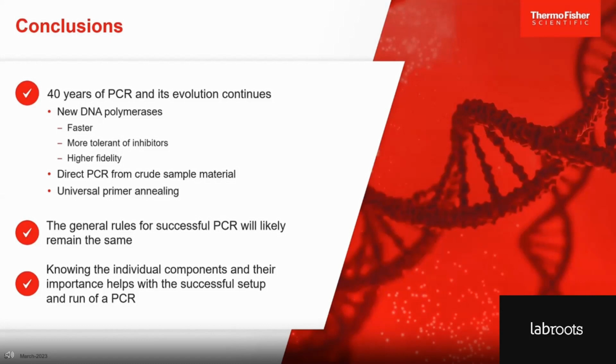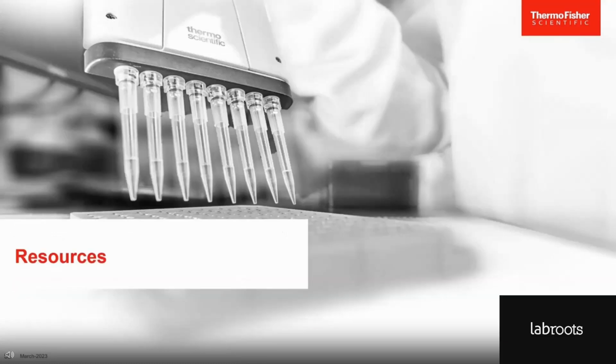It might be possible to run such a PCR without knowing too much about what's going on inside the vial. But if you do, it's much easier to develop a new assay, or even push the method beyond its current boundaries. Now, let's take a look at some resources.